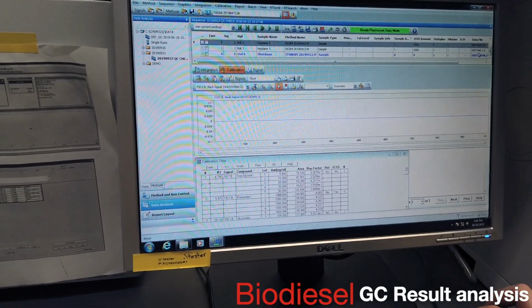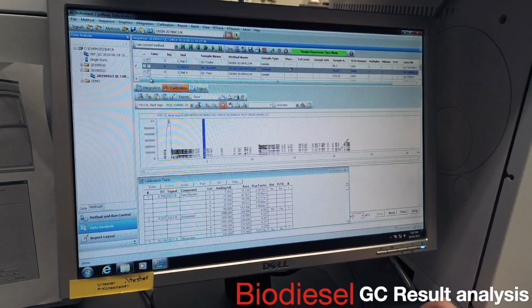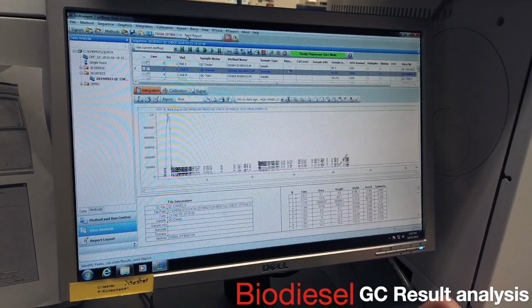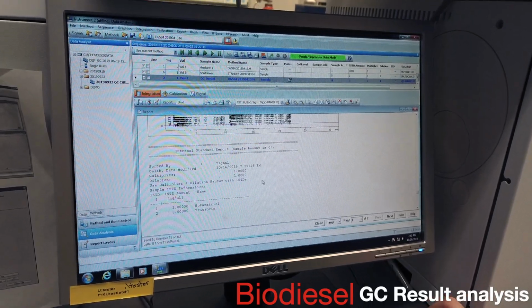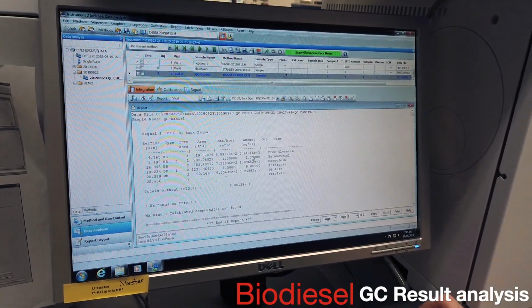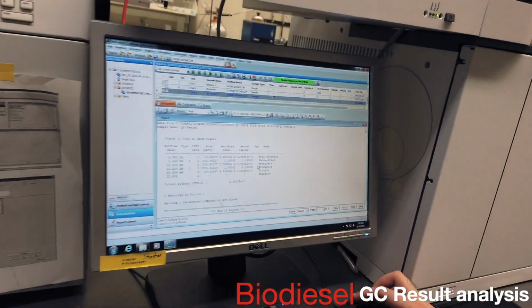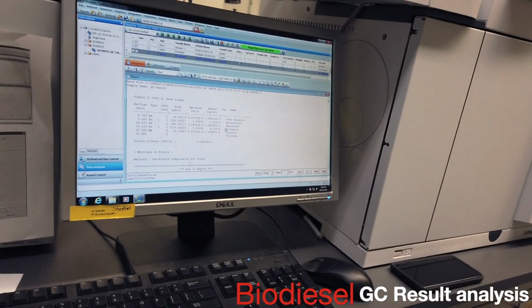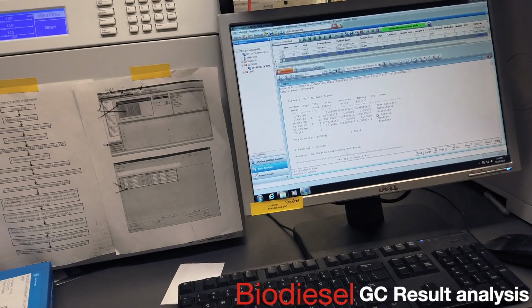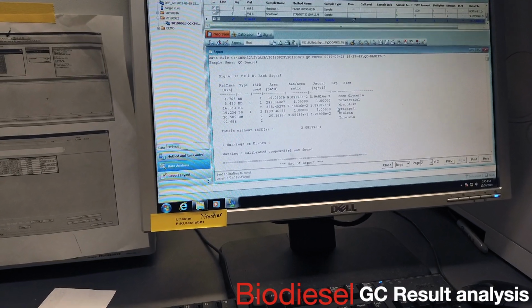Okay, so let's see what that looks like. If I go to mine, go to integration, just to make that a little bit. Okay, report, print report. Yeah, 1 and 8. Yep. Because it's supposed to be 0.005, and then 0.005, and then 0.242, so 0.2. Yep. And then 0.001 and 0. Yep. That worked. Yep, awesome.